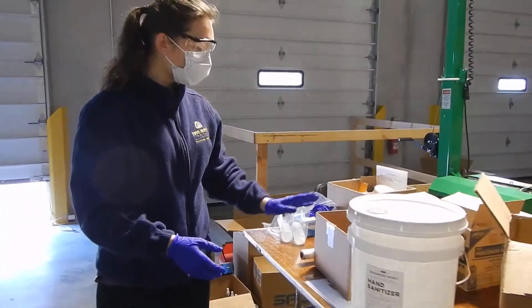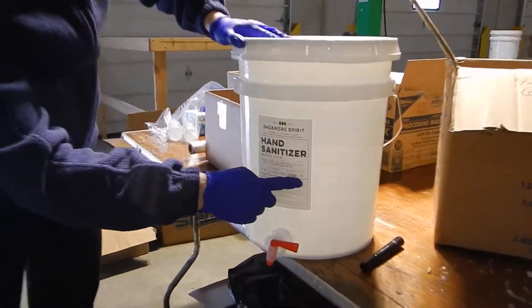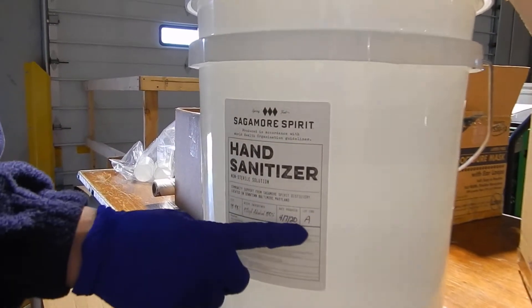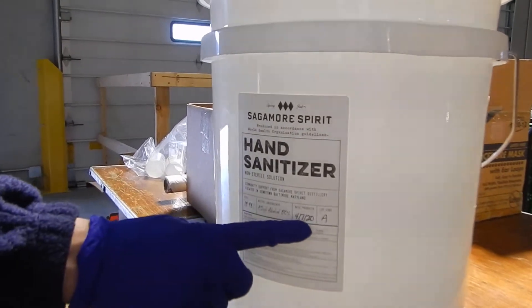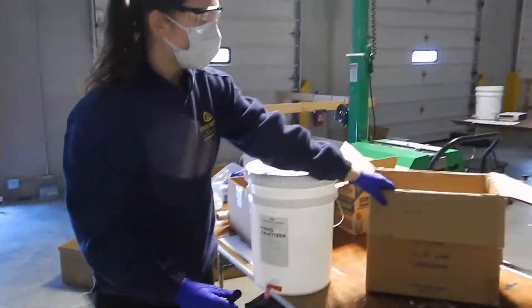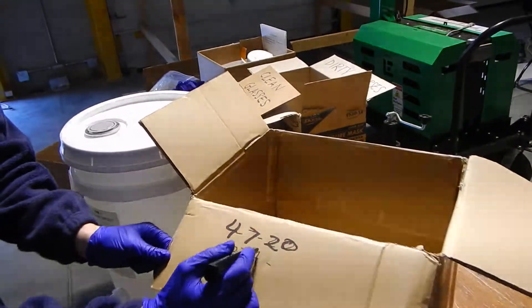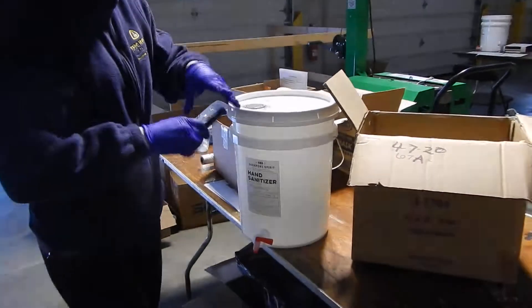When you're filling the bottles, look for the date and the lot code on your five-gallon bucket. This is what's going to be labeled on the finished product at the end of the process. Wherever you're putting your bottles after you fill them, make sure that the box is labeled with the same date and lot as your five-gallon bucket — that's where you're going to put your bottles.